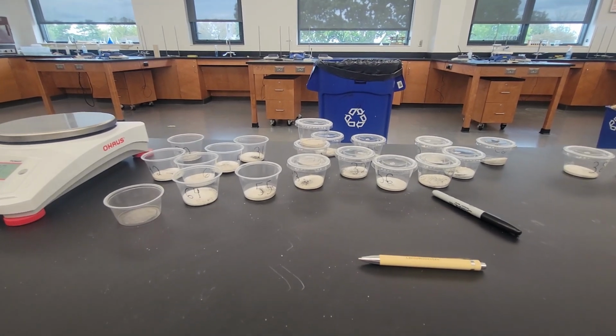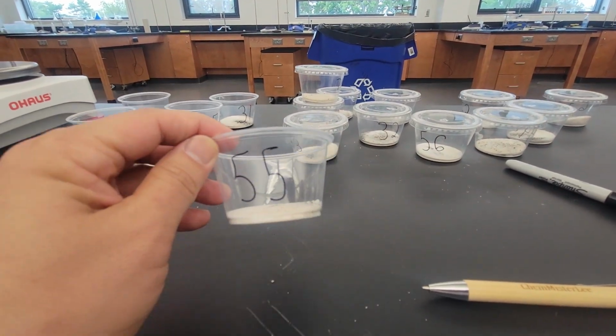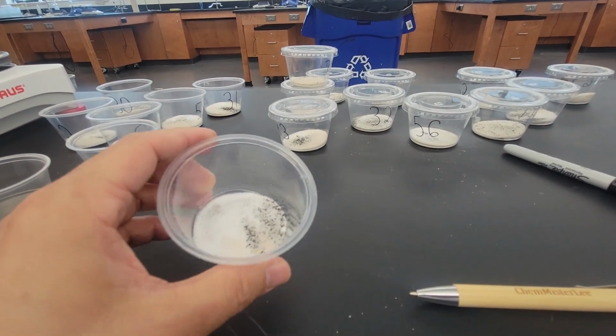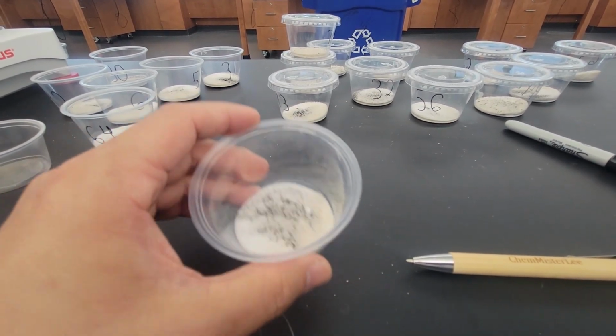Let's go over your separation lab from today. There were hundreds of samples. I'm just going to pick one. Got sample 55. And this has, well, they all have some amount of sand, salt, and iron mixed in here.